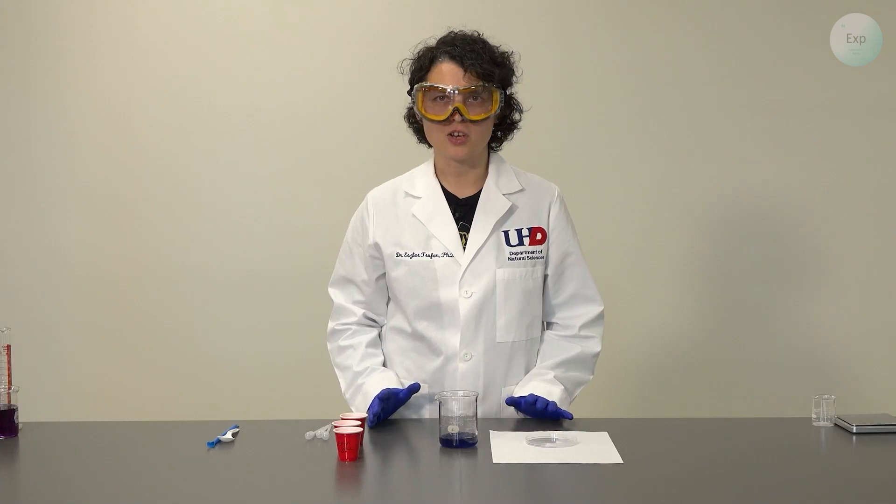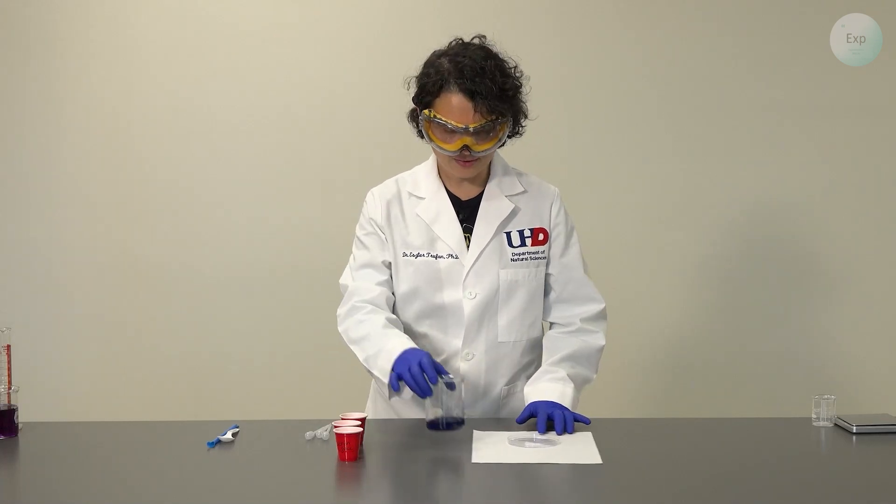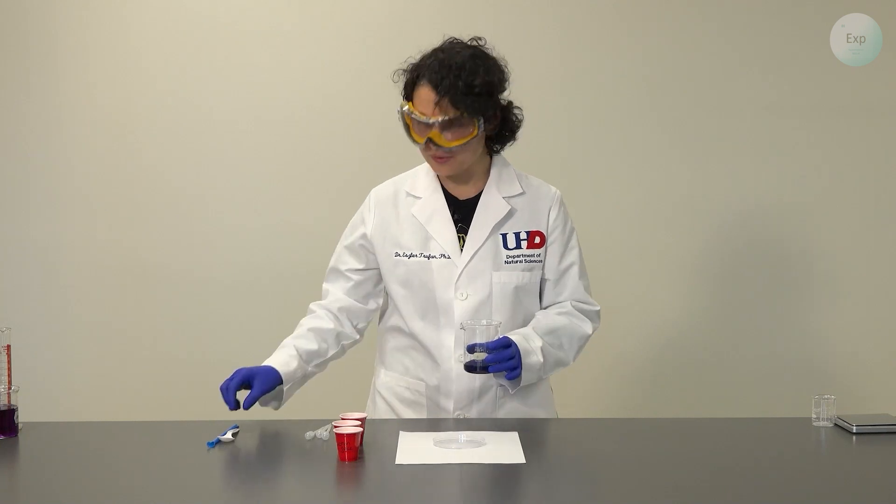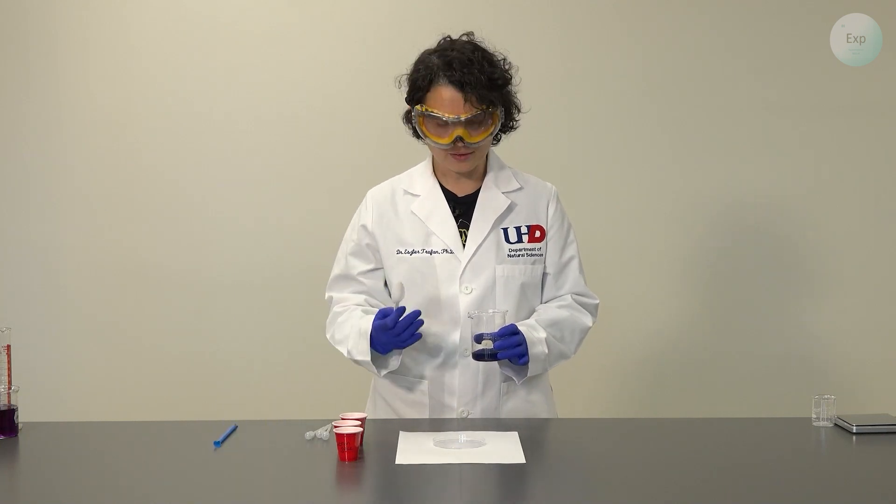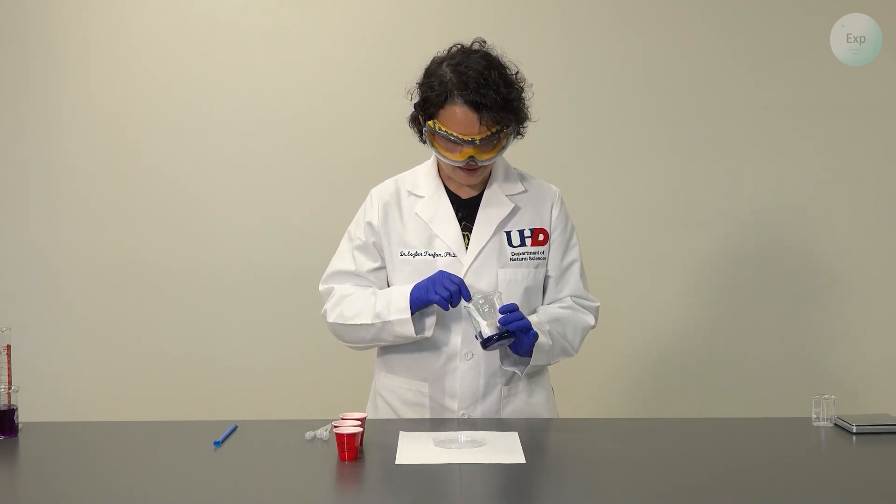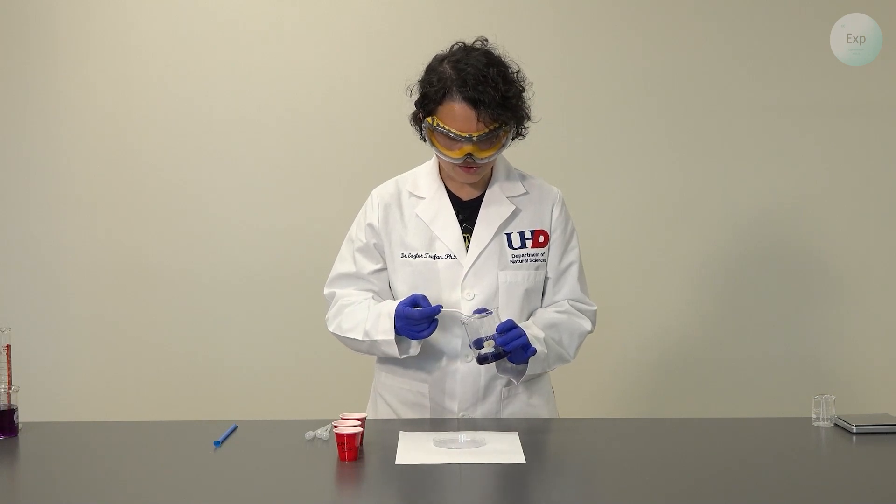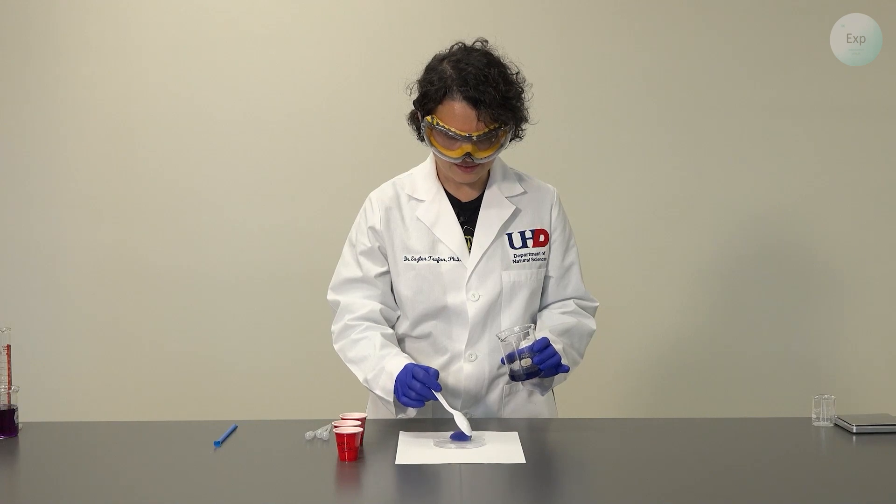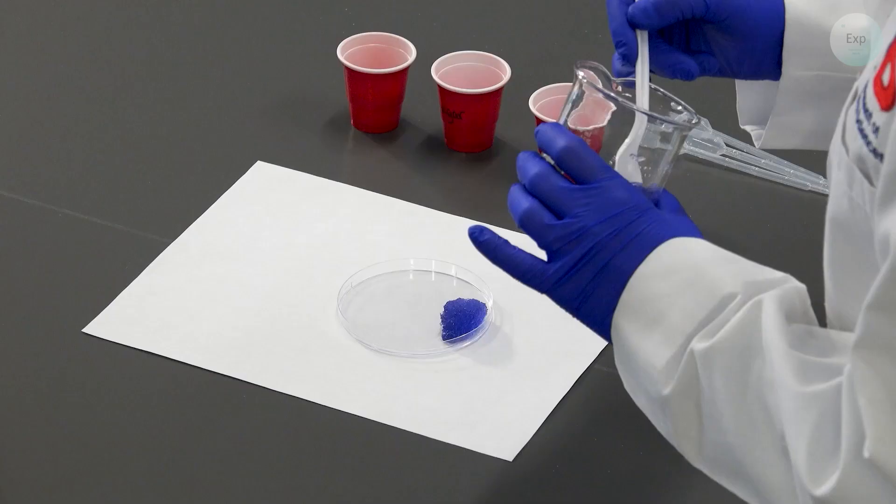Now that we have a fairly solid gel, we're going to place our petri dish on the white piece of paper. This will allow us to see what color we're observing. And then either using a spoon or a spatula, we will transfer three mounds of the indicator separated from each other.